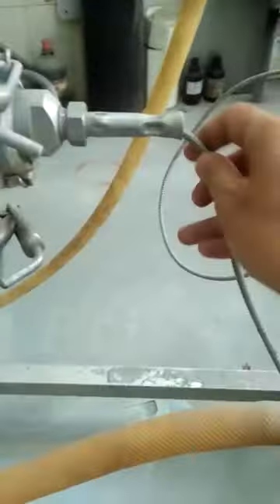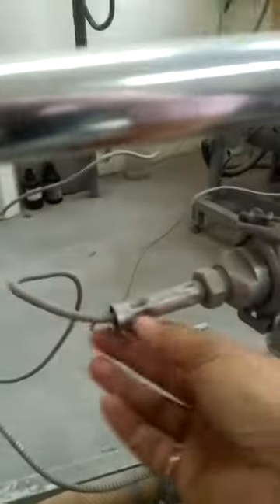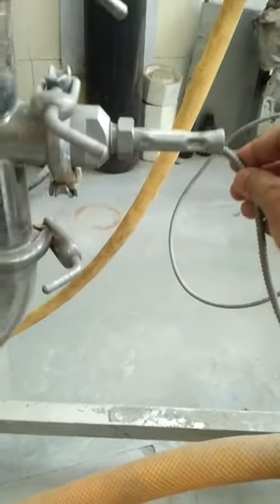Then via this pipeline at this end, there is another module which is connected in series with the previous one. After getting through this, we can see there is a pressure measuring attachment connected to the pressure gauge — both at the inlet side and at the outlet, which is the discharge end of the membrane module. This will be the feed pressure and this will be the retentate pressure.